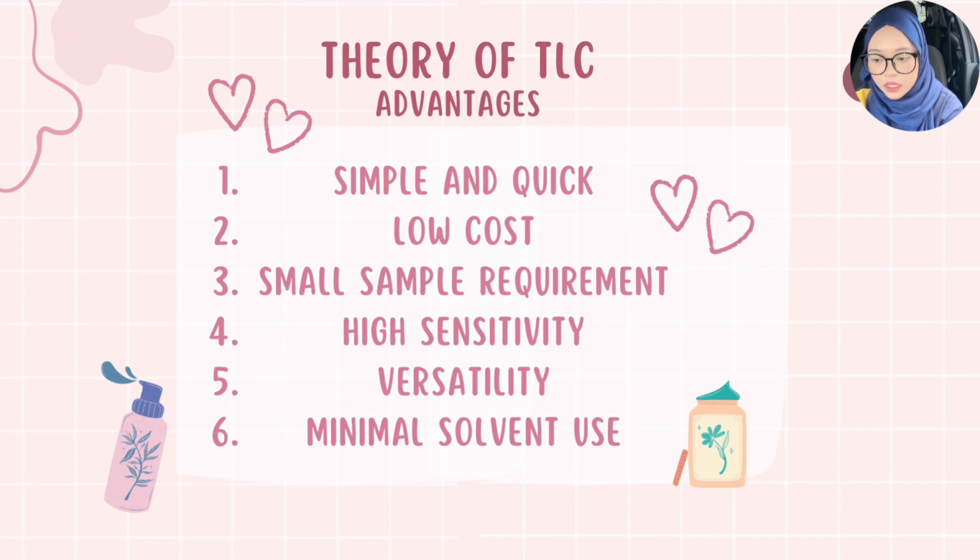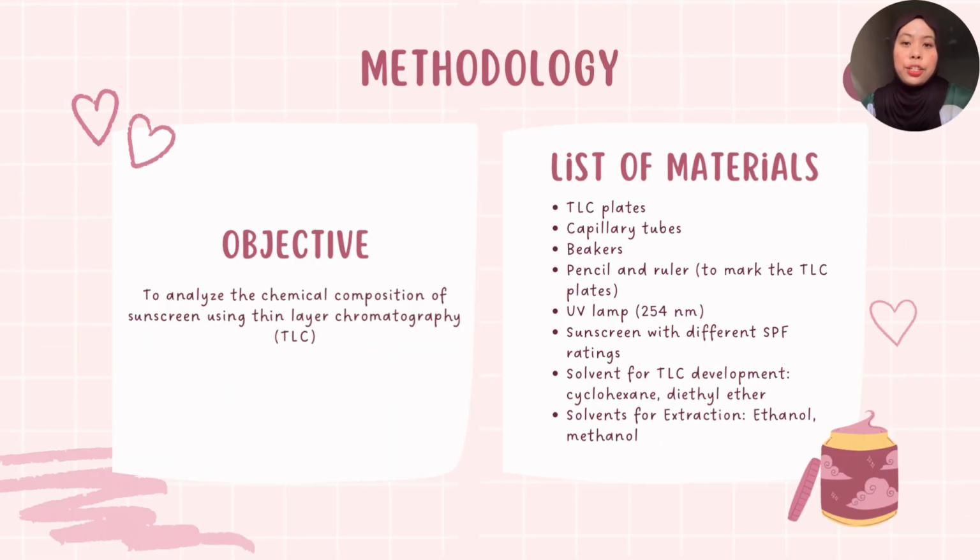Next, high sensitivity. TLC can detect compounds in low concentration, especially with appropriate visualization techniques. Next, versatility. It can be used for a wide range of compounds, organic, inorganic, and mixtures. Lastly, minimal solvent use. It typically uses small amounts of solvent, making it environmentally friendly and economical. I will proceed with the methodology.